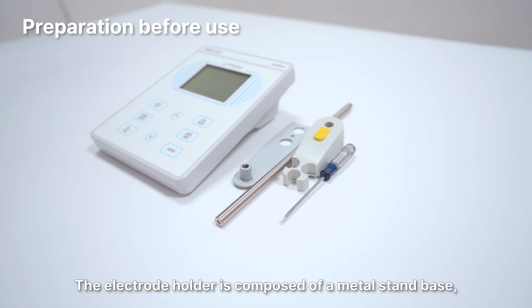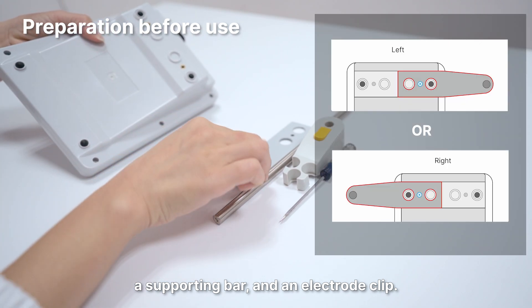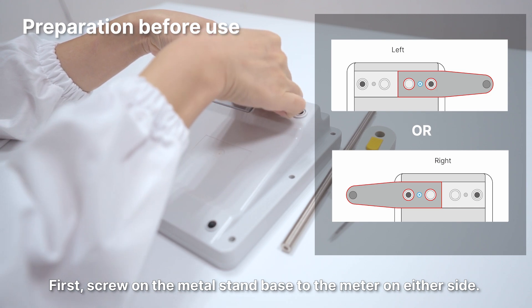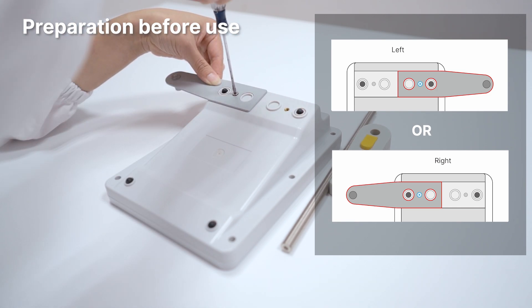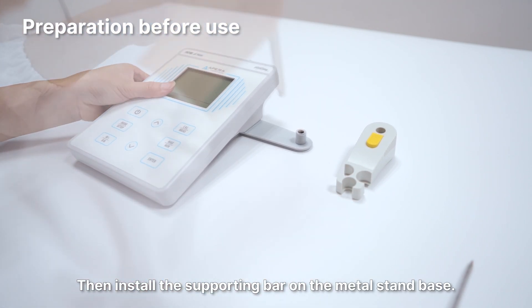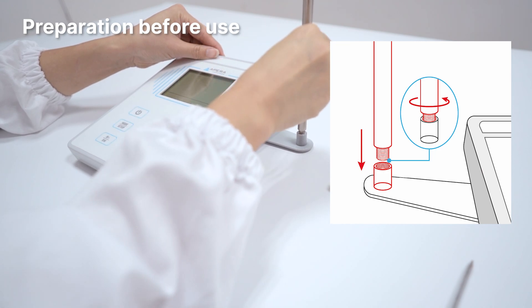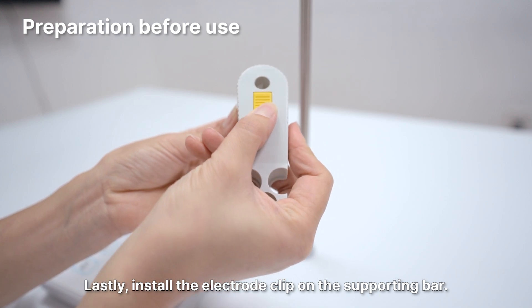Preparation before use. The electrode holder is composed of a metal stand base, a supporting bar, and an electrode clip. First, screw on the metal stand base to the meter on either side. Then install the supporting bar on the metal stand base. Lastly, install the electrode clip on the supporting bar.